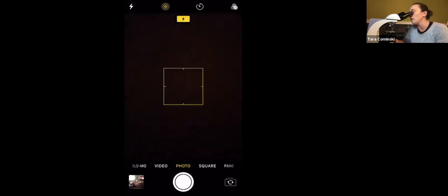Again, sorry if that's not totally clear, but what I'm going to do is turn the fine focus adjustment, as I said, and determine what's on top, what's in the middle, and what's on the bottom. You're doing that as you move through using the focus knob. Like I said, we'll do this together. This is something you need to do and get the feel for yourself, but I thought it was worth still going over.